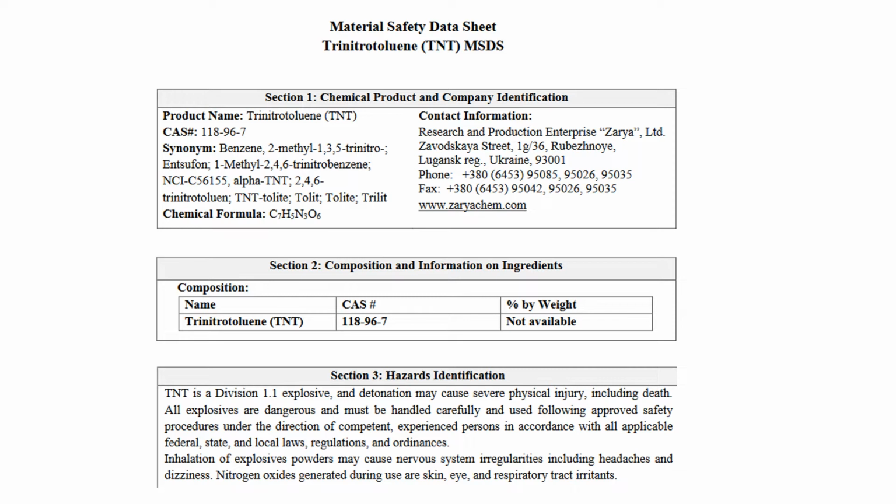However, every laboratory or warehouse worker cannot be expected to know the properties and hazards of all materials, and therefore, it is important to realize that safety can be implemented only when awareness on the hazards posed by chemicals and other materials is shared between all those concerned.